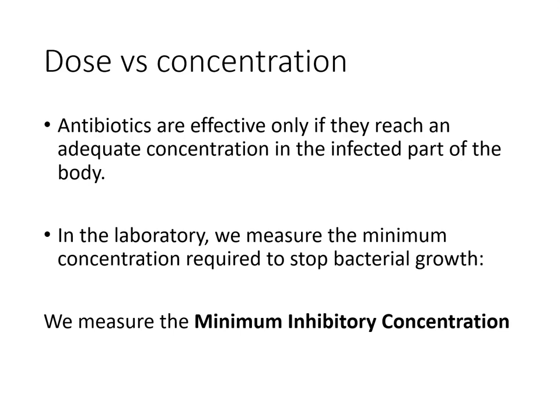But once you know which antibiotics will go where, then you need the other data, which is which antibiotics and what concentrations are necessary. So I'm going to show you two things. I'm going to show you the minimum inhibitory concentration. This is a direct measurement of how sensitive a bacterium is to an antibiotic. And I'm going to show you disk diffusion, which is how we figure out which antibiotics to use.